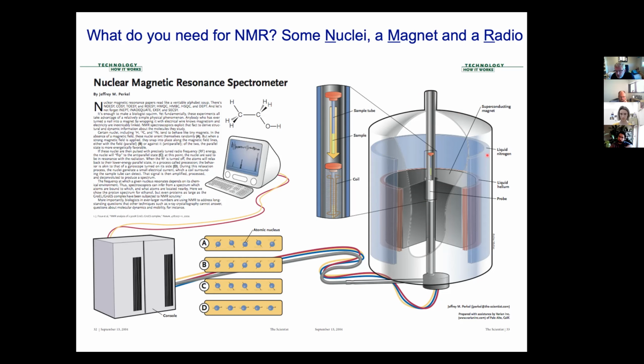And if you look closely, there is something in blue here, which is a layer called liquid nitrogen, right? And if you look closely here, this orange stuff, there's a layer called liquid helium. So basically what this is, it's a thermos. Here's my thermos. And I keep my water cold, right?